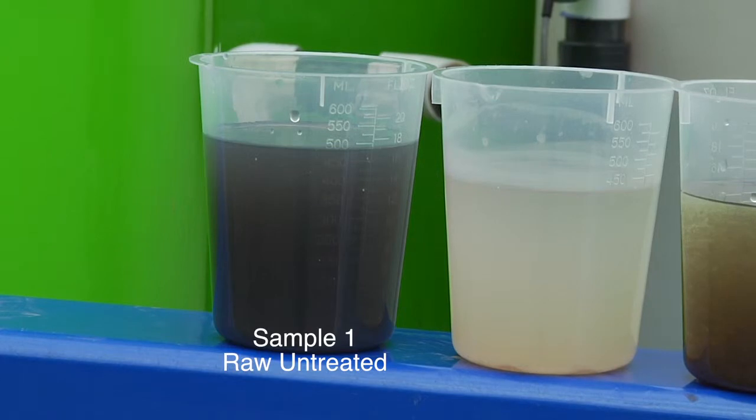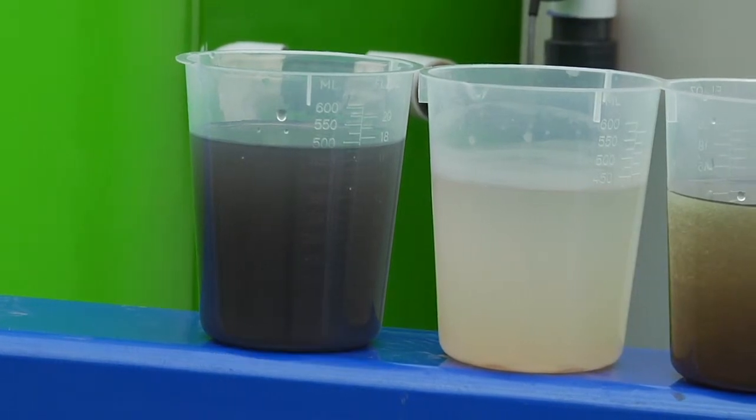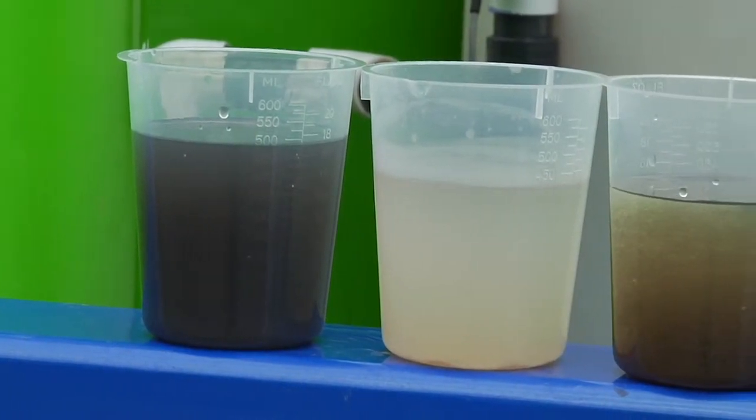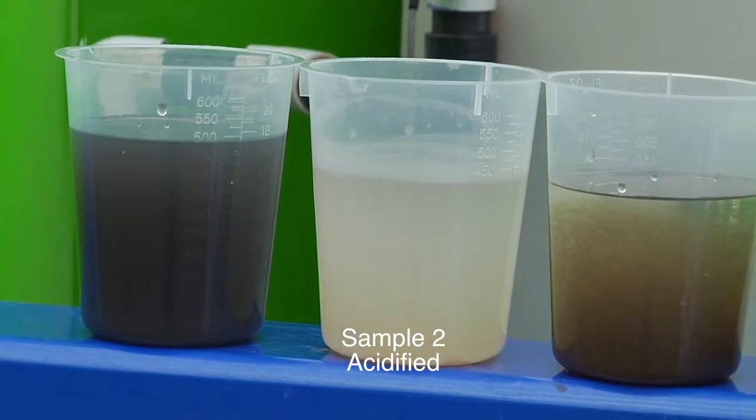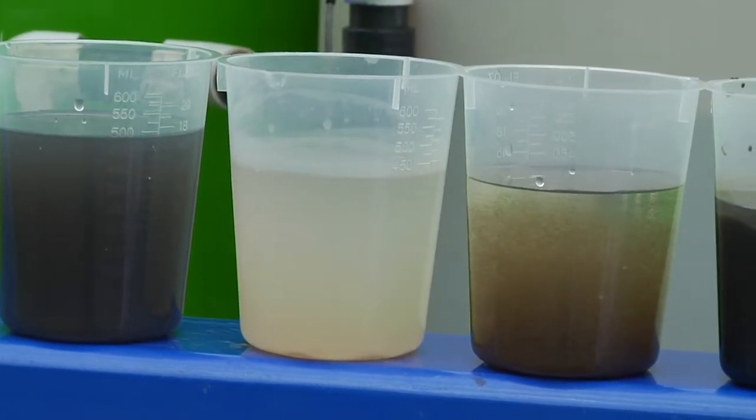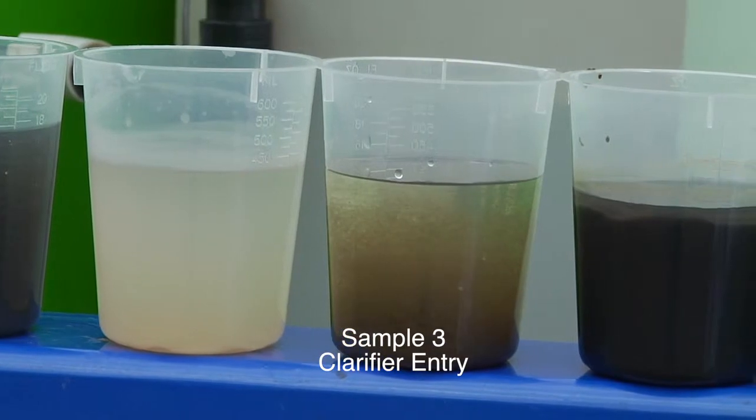This first sample is the raw untreated water coming into the system. The second sample is the acidified water from the receiving tank. Number three is the sample as it enters the clarifier.